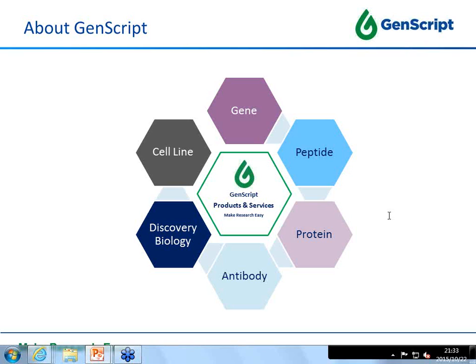One more question is, do we carry out developability studies for the recombinant antibody? Yes. You mean the stability assay, or the characteristics of the cell bank? I understand developability in general for the antibody. The stability. So we normally do the stability assay during different generations of the antibody, to test if they have consistent producing yield. This is our basic QC procedure before delivering the stable cell line. Is this the answer for your question? I'm afraid that I missed some point. Partly, but to some degree it addresses the issue.